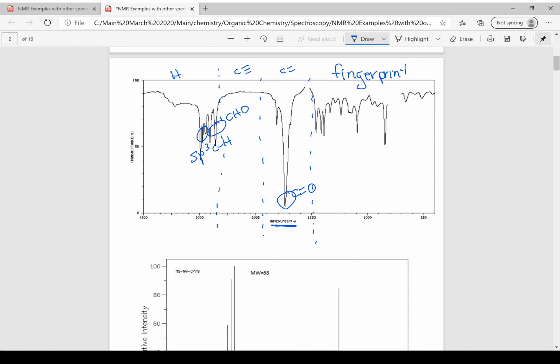All right, and then is there anything in this fingerprint that is really jumping up and down? Not to me. Now this peak right here is noteworthy, okay? I don't really know what it could be. Is it harmonics? But it is noteworthy. And remember, anytime you have a carbonyl, this is the harmonic peak or overtone. In this one, I know it's not anything, but if you were looking at this and nothing else, you would have to say, huh, I wonder. All right, and so what functional group do I think I have on here? It looks like an aldehyde.